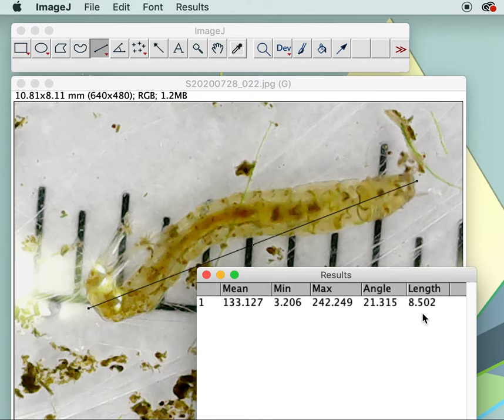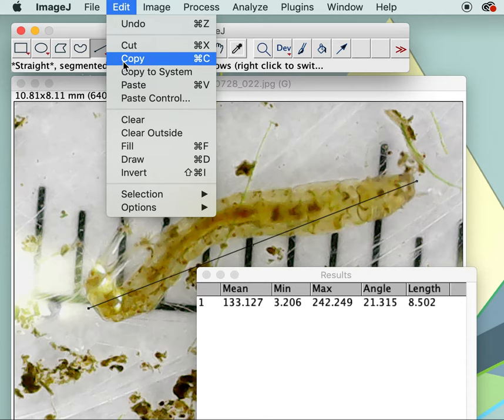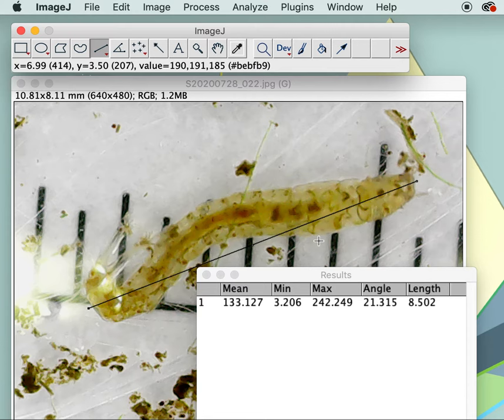If I were to click away, this line would disappear and I want the line to stay there. So I go up to Edit > Draw — that will put the line permanently on the photograph. If you don't do that, the line will disappear when you click.